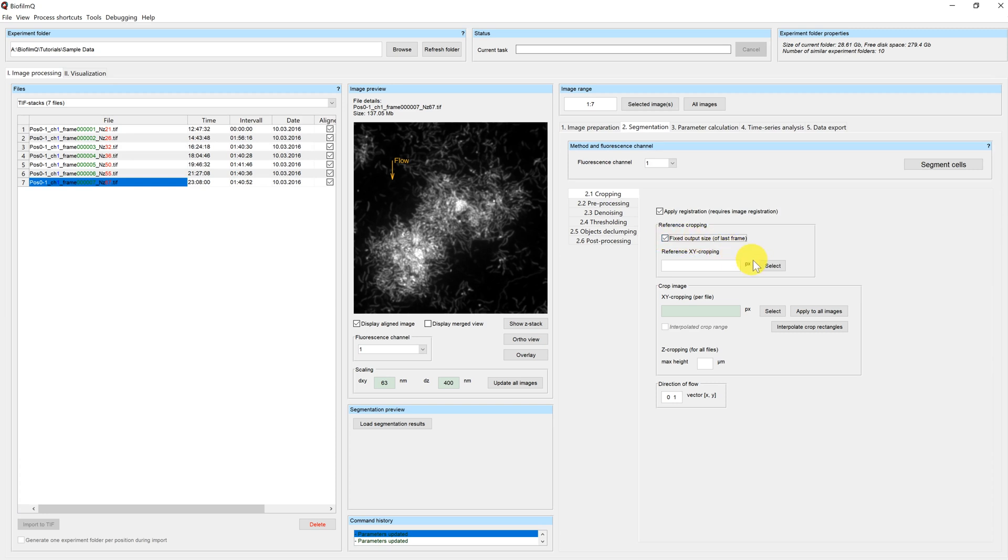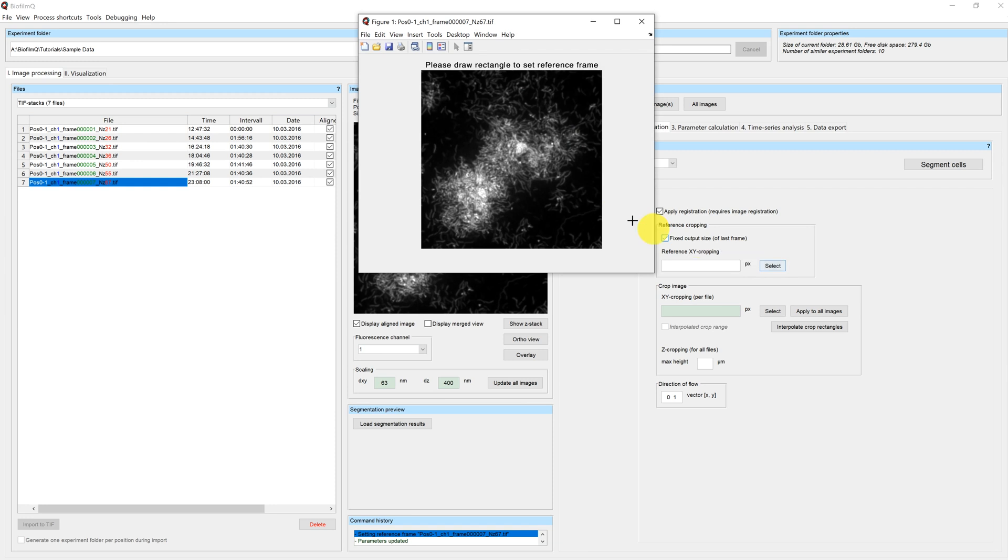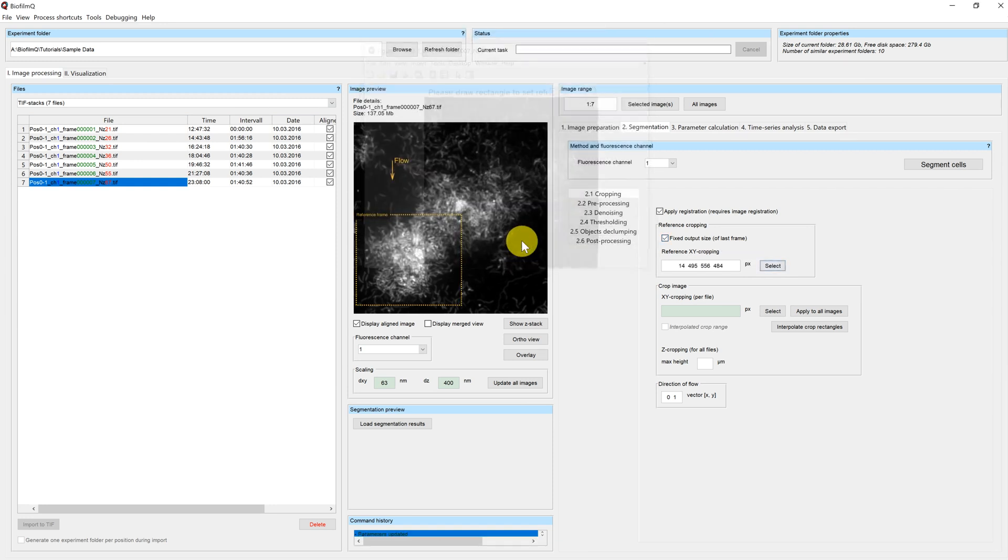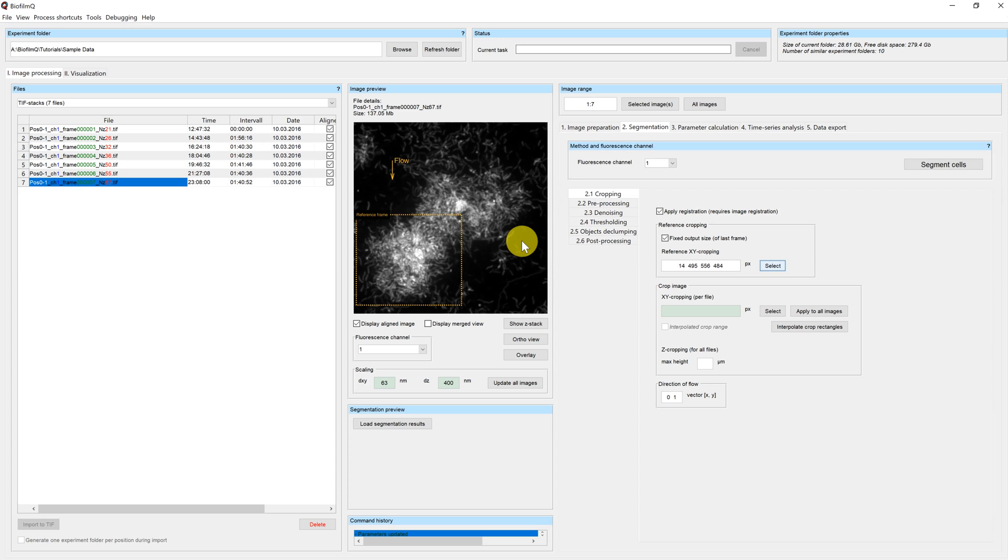By clicking on this button select, a window opens where you can now select your reference frame. So by creating this reference frame, we have now put all our cubes into the same coordinate system.